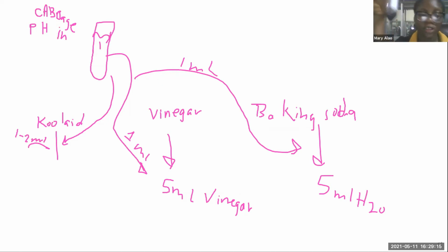Okay, determining the pH of what? Am I going to set up the test tube again? Listen, this is what you're going to use. You're going to use solution 1. You're going to use vinegar because you know that vinegar is acidic, and then you're going to use baking soda, because we know that baking soda is basic. So just to be clear, you're going to use 1 to 2 milliliters of your cabbage indicator.